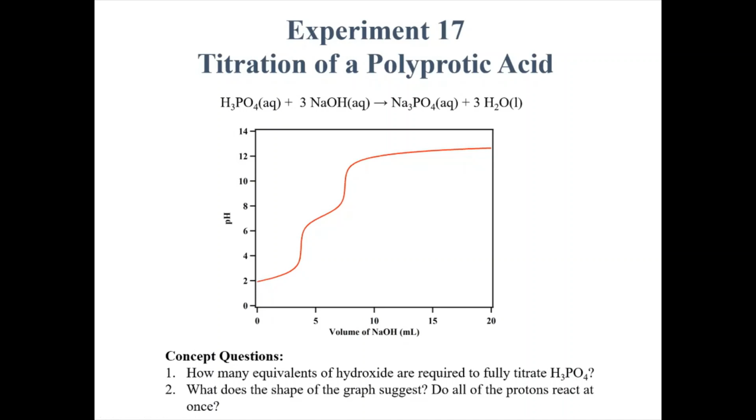In this video, we're going to look at experiment 17 and the titration of a polyprotic acid experiment. Some of you guys did the titration of a monoprotic acid already, so you may have a better sense of how the experiment's set up and what you actually do in lab. For those that haven't, we're going to try to simulate this in this video as best as possible, so you can actually see where everything goes and what we're putting together.